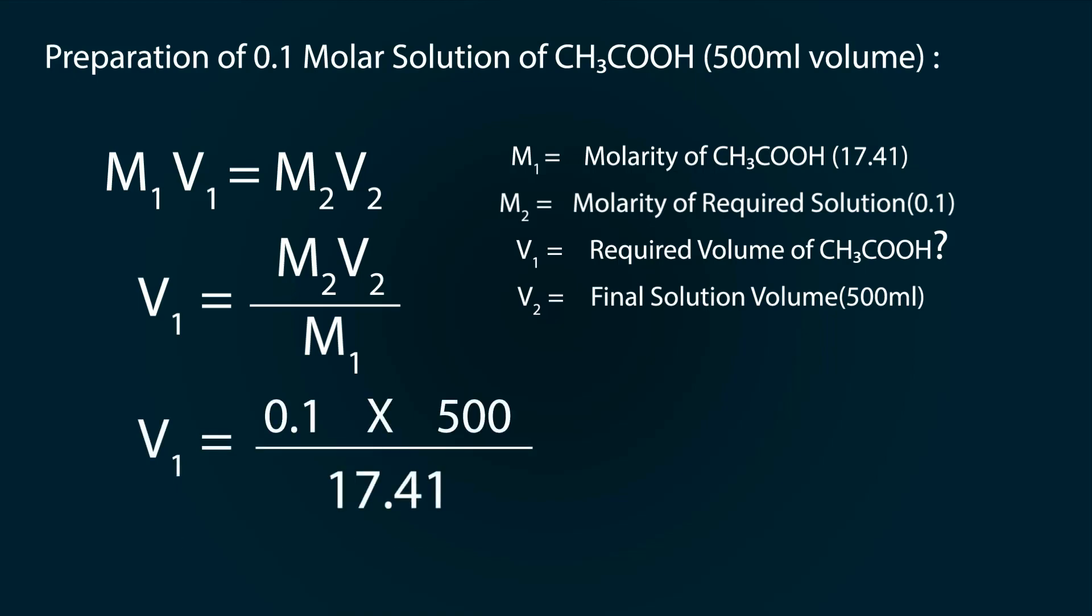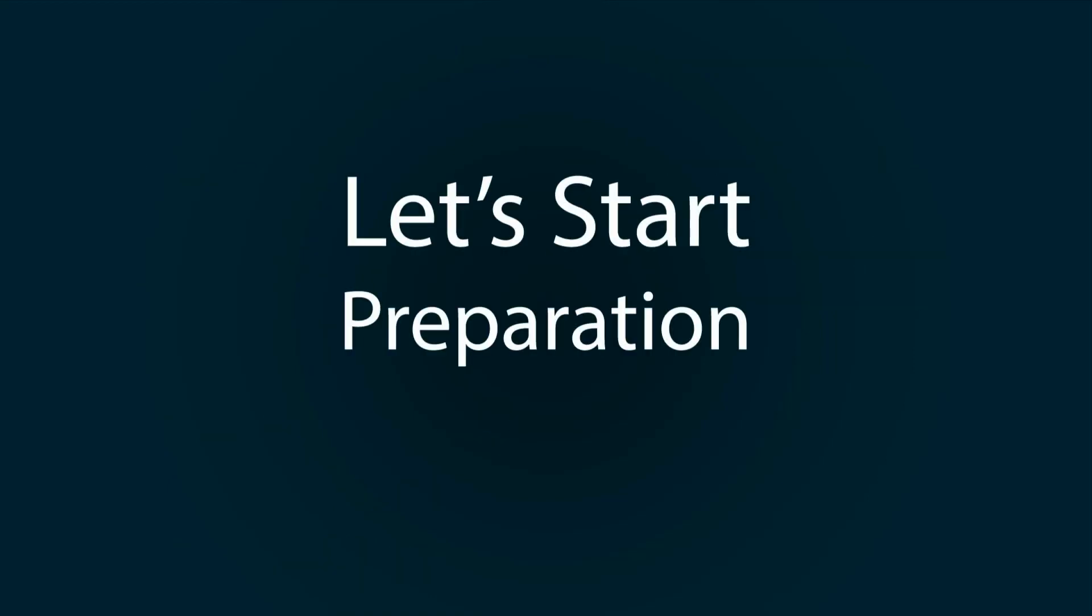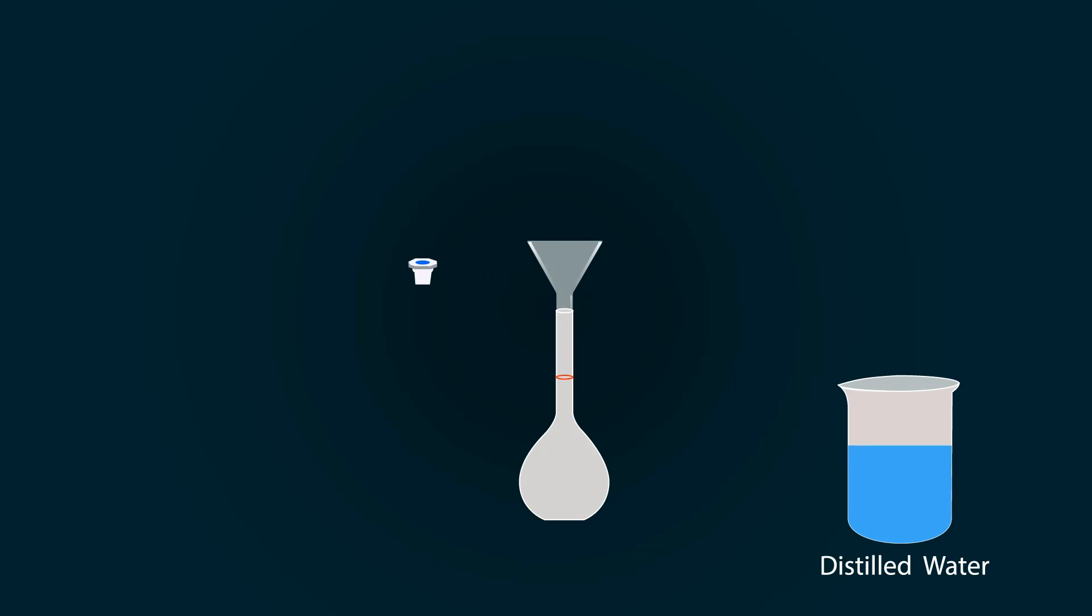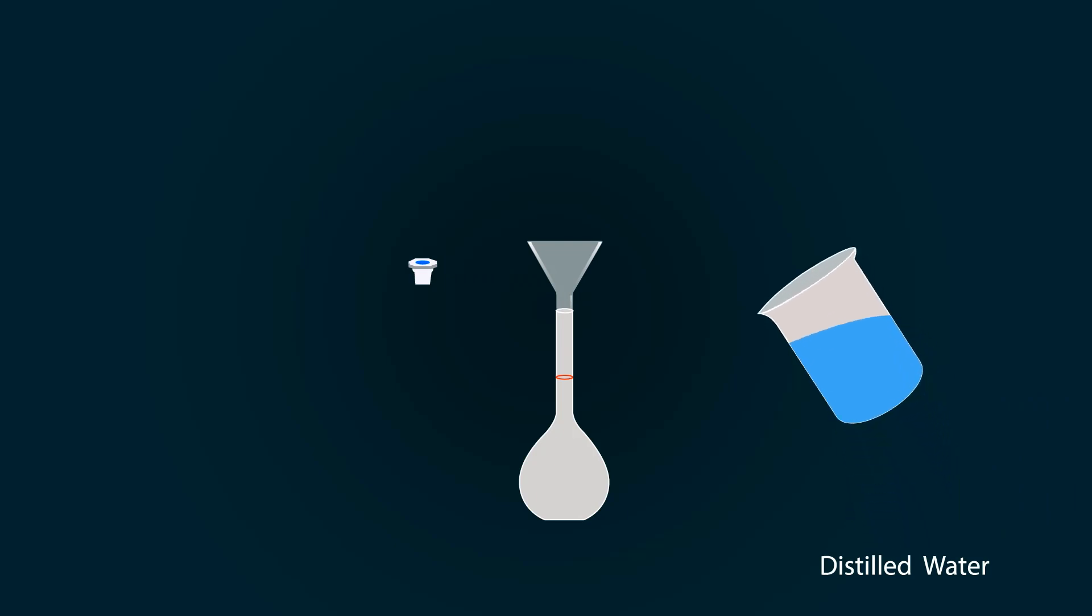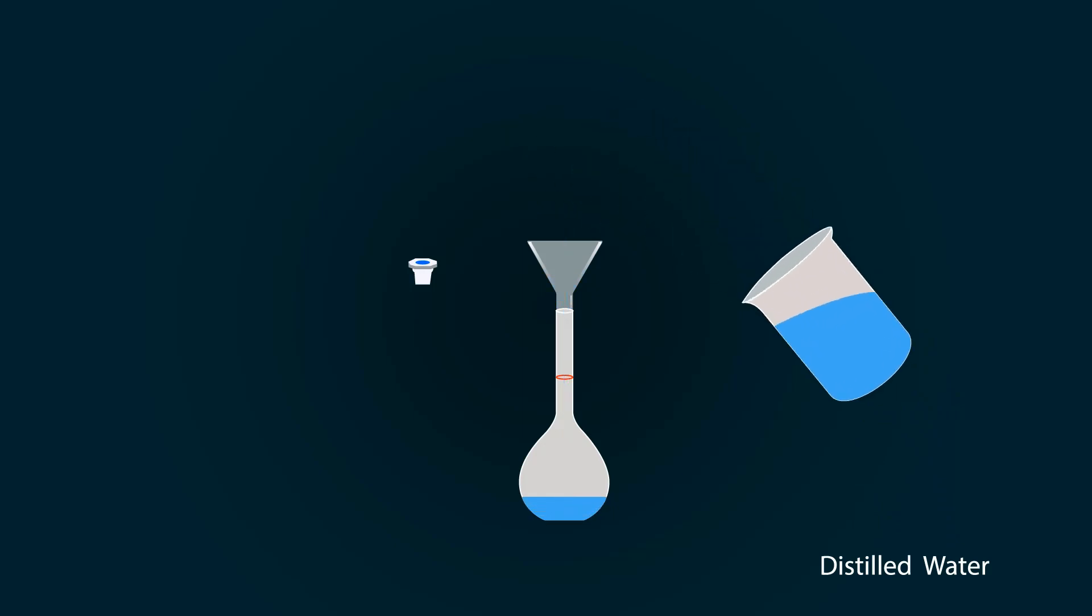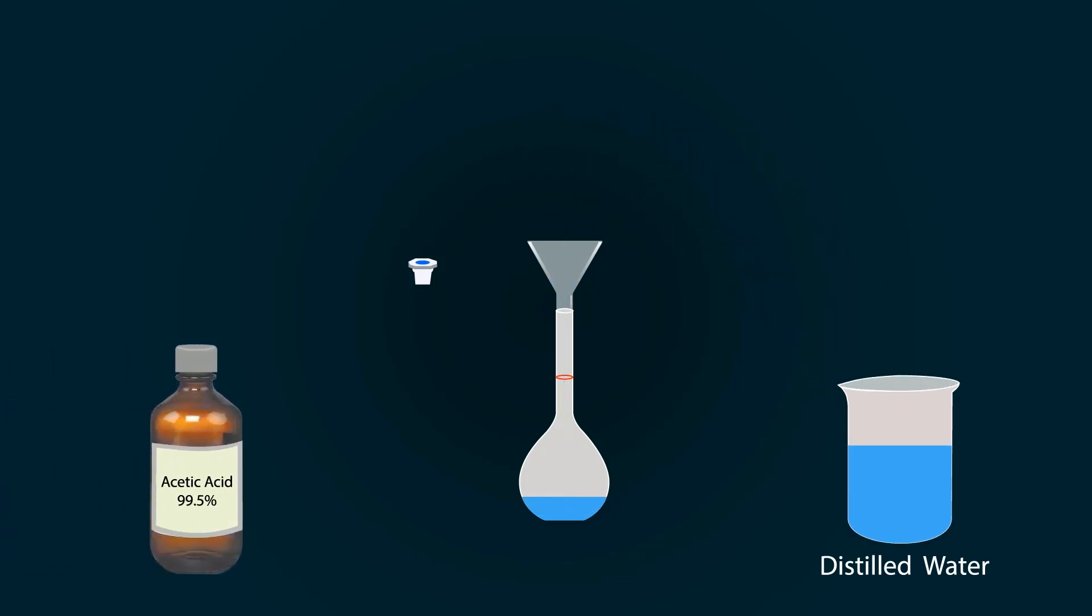Let's start preparation. Take volumetric flask of 500 ml, put the funnel on the top and add some distilled water into it. Please do not add acetic acid directly into the volumetric flask because it may burst.